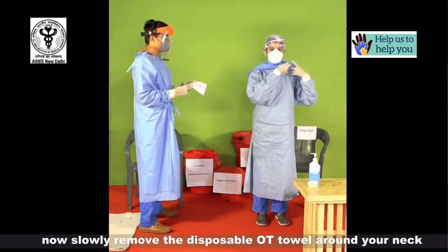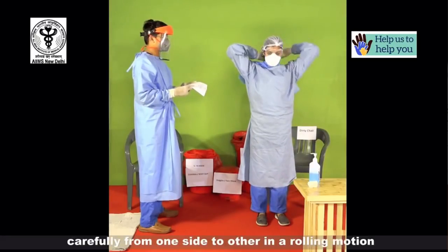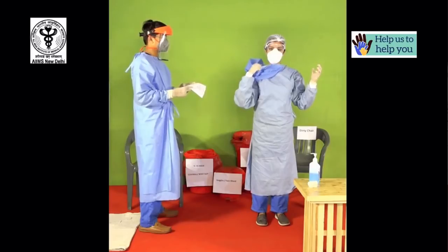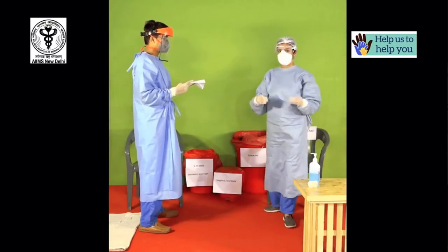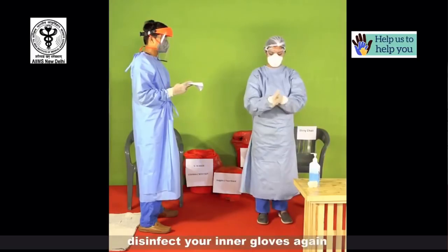Now slowly remove the disposable OT towel around your neck carefully from one side to the other in a rolling motion. Discard the OT towel. Disinfect your inner gloves again.